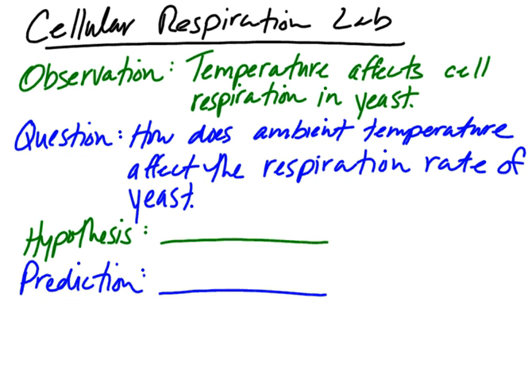Alright, this video is your pre-lab for the cellular respiration lab, the observation, which is part of your pre-lab. Temperature affects cell respiration in yeast. The question: how does ambient temperature affect the respiration rate of yeast? That is a question. Okay?